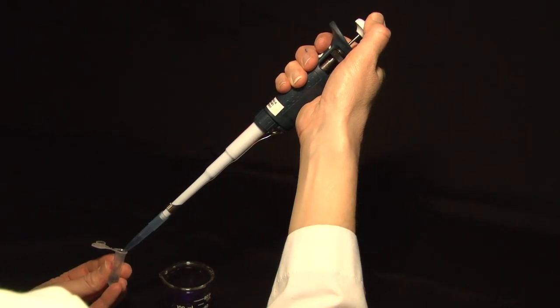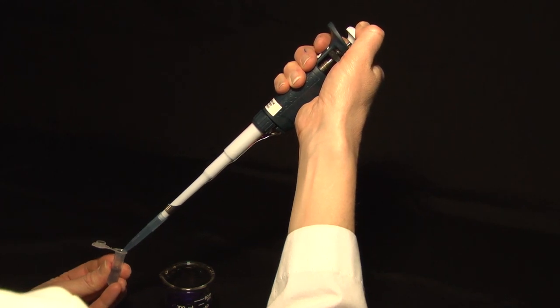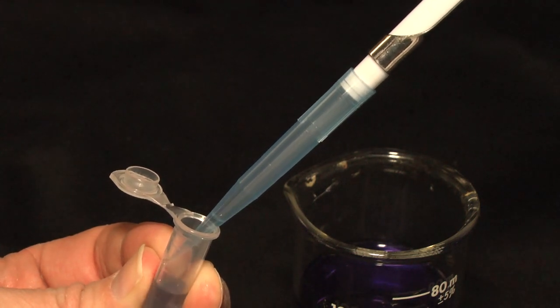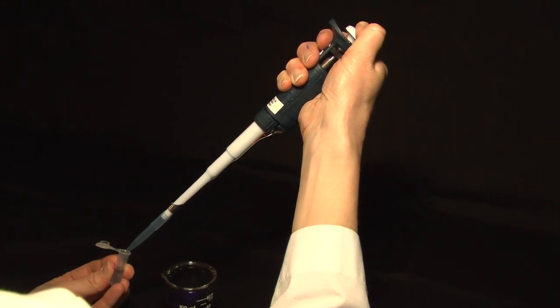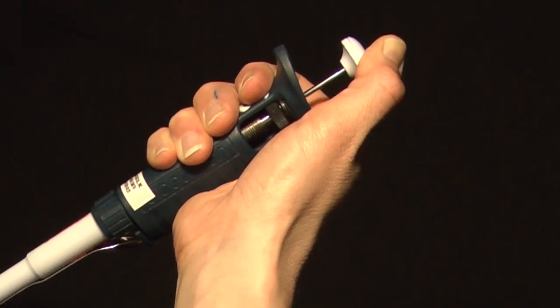To dispense liquid from the tip, depress the plunger slowly to the first stop. Pause, and then press to the second stop to purge the rest of the liquid out of the plastic tip. With the plunger still pressed down, remove the tip from the liquid, and then allow the plunger to return to the up position.